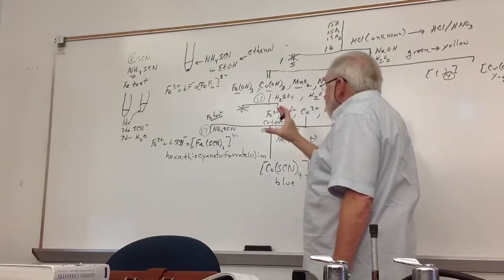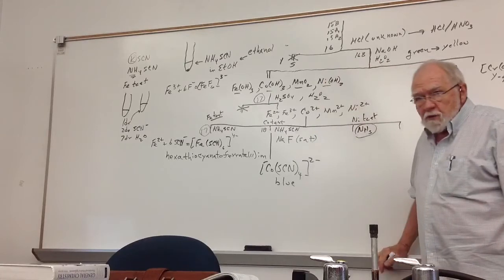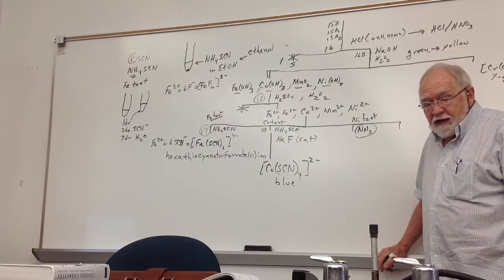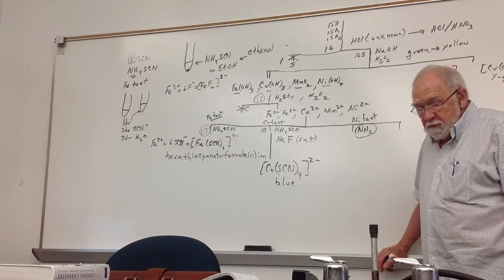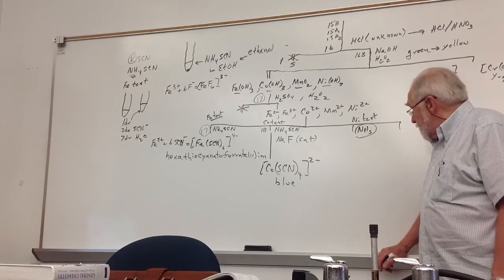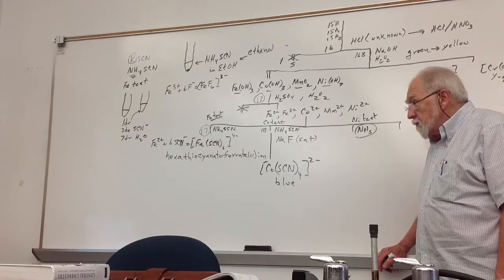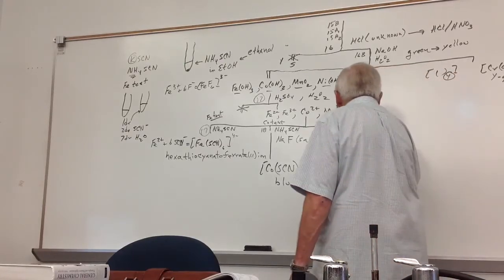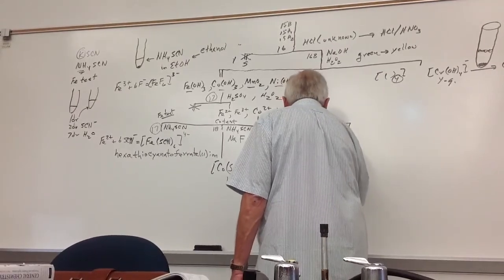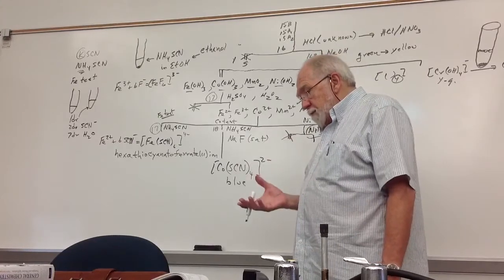Now, if you had a lot of iron in your sample, this is going to make a precipitate with the iron. You want to remove the precipitate because it's going to be a reddish-brown colored precipitate or greenish colored precipitate. But the point is it's going to interfere with the precipitate you're going to try to make with the nickel. So if you make a precipitate, when you make it basic with ammonia, remove the precipitate. So I'll do this little thing right here. And then it's going to make the complex with nickel.